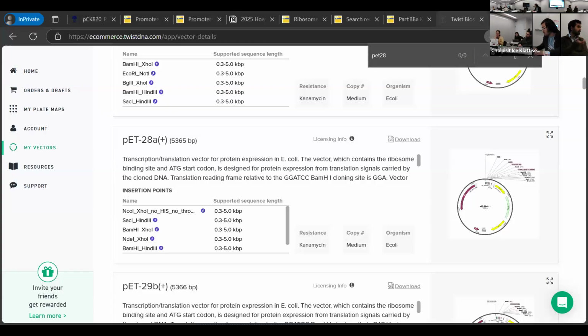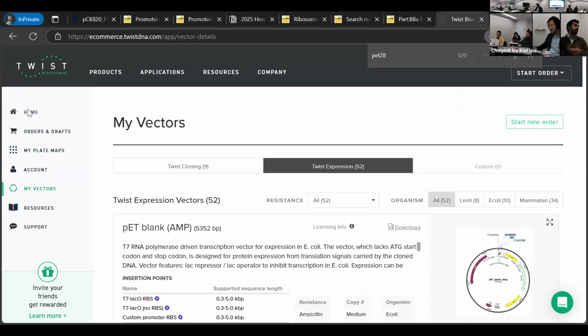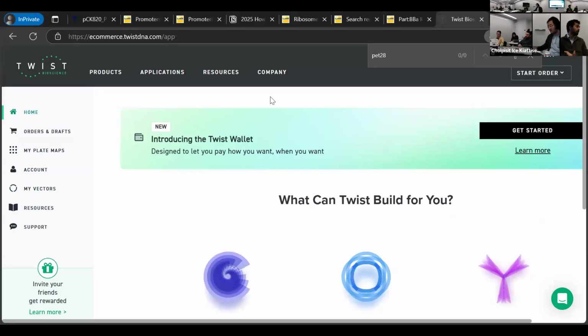I guess it depends. For example, are you talking about which system, cell-free or E. coli? You can do either one, either one's totally fine. Generally the way we've done it most of the time is through the E. coli system, just because we haven't really tried cell-free. But you can also plan for cell-free too. Again, you can express this plasmid in an E. coli-based system as well, so it should work theoretically.